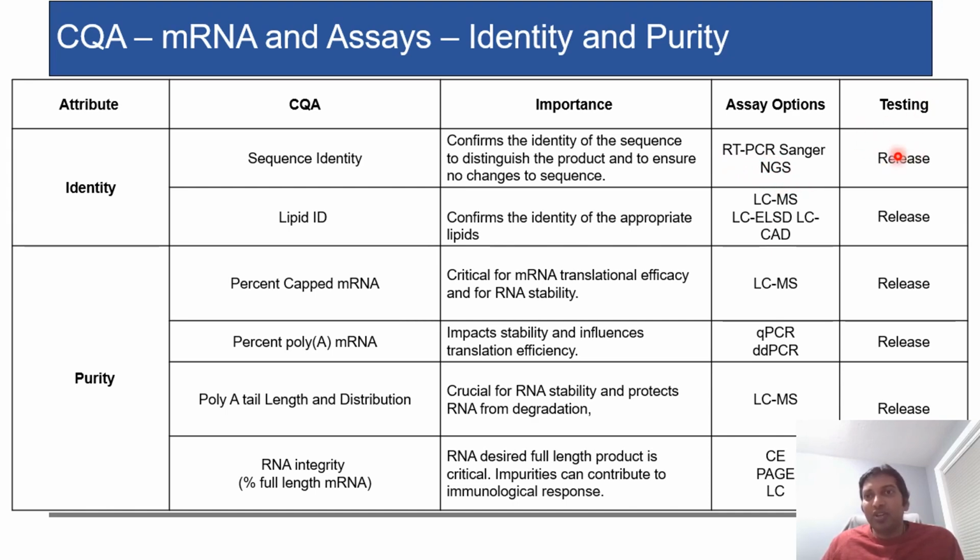A very important thing to understand: a release assay is an assay where you do a lot of qualification and validation, really understand the limits of the assay, and define a limit of quantification. The assay has to be established very thoroughly, so that you always have your system suitability running, and when you run these assays you are very confident with the data that comes out. So those are release assays. They are very stringent, and that's the way we need to develop these assays, because they are talking about a very specific quality attribute, and that attribute has to be really defined from that assay.